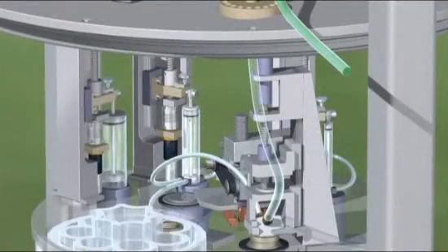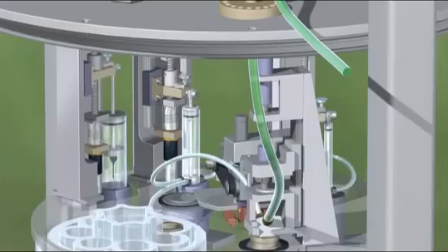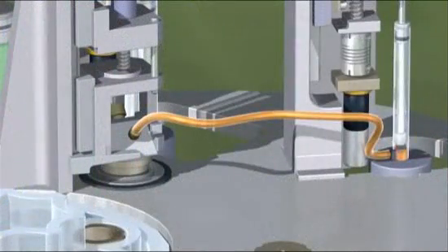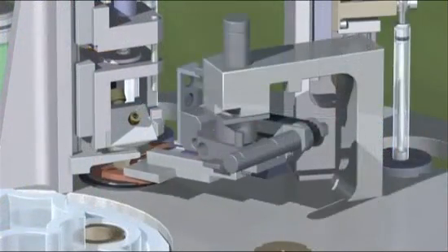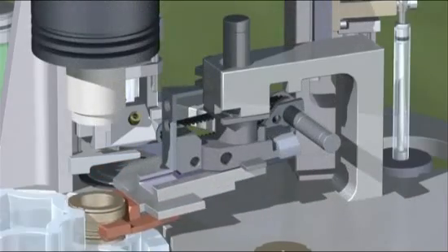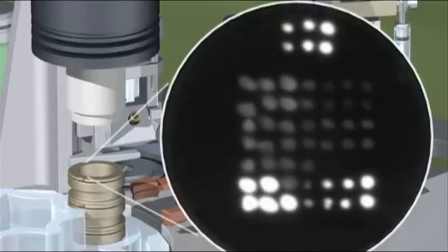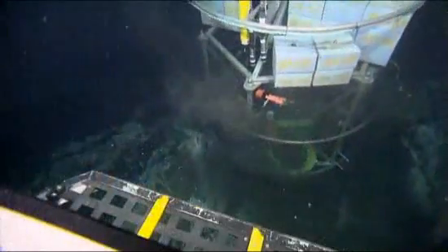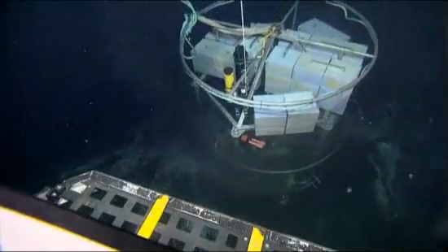We have intake valves and we draw in seawater with a syringe. We create a vacuum and basically pull the seawater through a filter that collects a particular size of particles. Using onboard robotics, ESP can do tests ranging from detecting microbes and toxins to basic DNA analysis. Each one of these lines represents a different organism. The ESP has enough battery power to last roughly 30 to 45 days. The goal is to have something that can go out for 6 months.